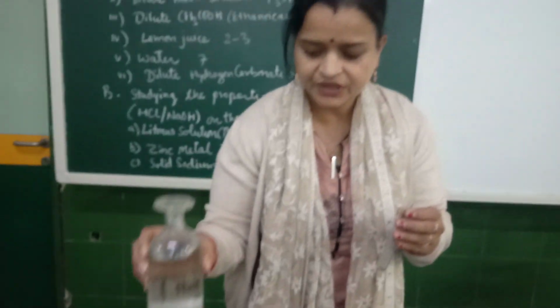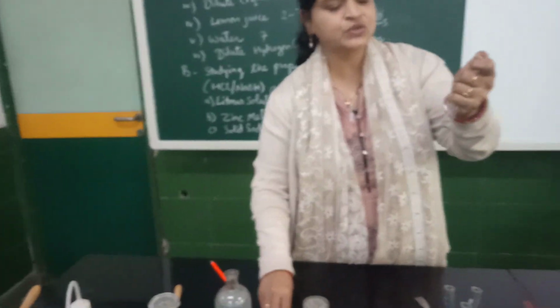This is a zinc granule. Now NaOH. Can you see very small bubbles? It is not as reactive as HCl, but still there is a reaction happening. Only a few bubbles. Okay, so here there is a gas release, that is also hydrogen gas.